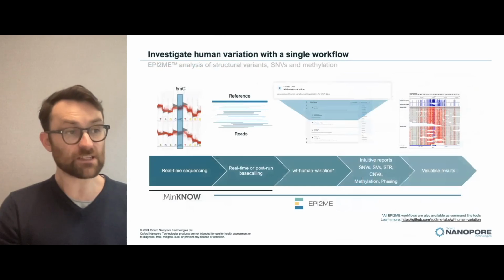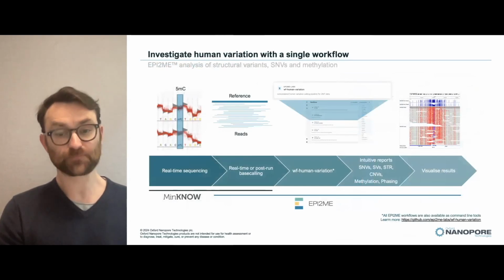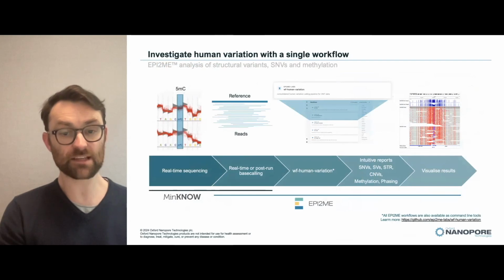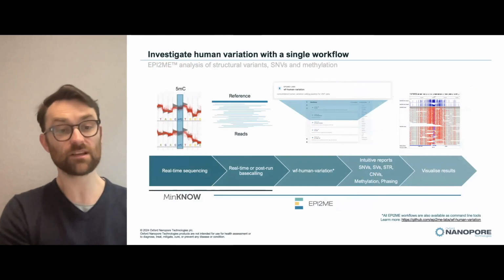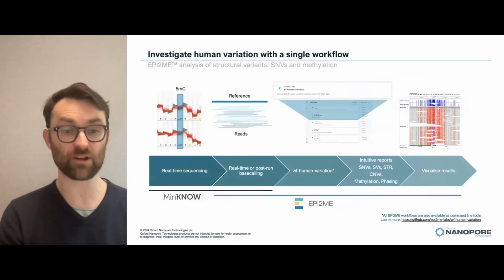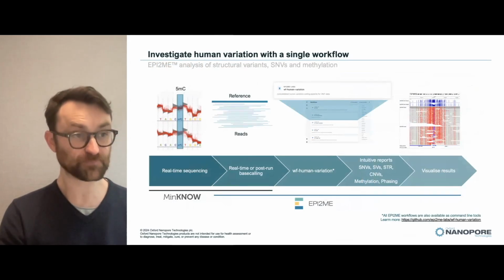In terms of analysis, we recommend using EPI2ME. This is a very intuitive software. We have a graphic interface, but you can also run it via command line. This can be run while the sequencing is still ongoing in MinKNOW, or you can do it after the run.